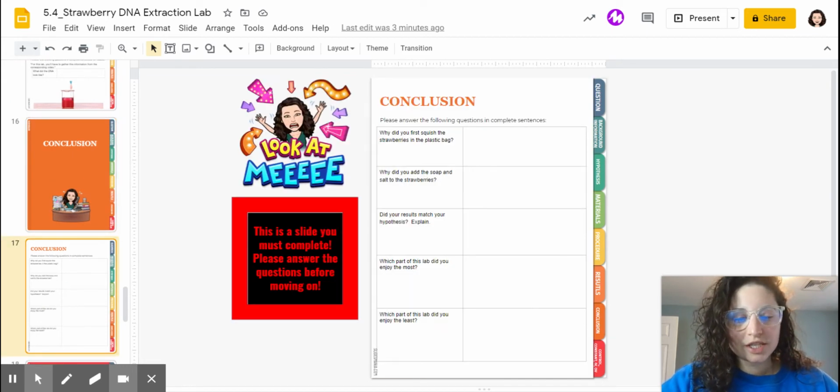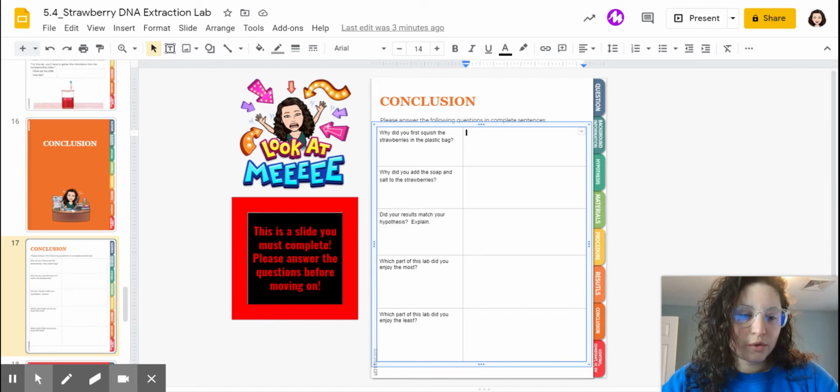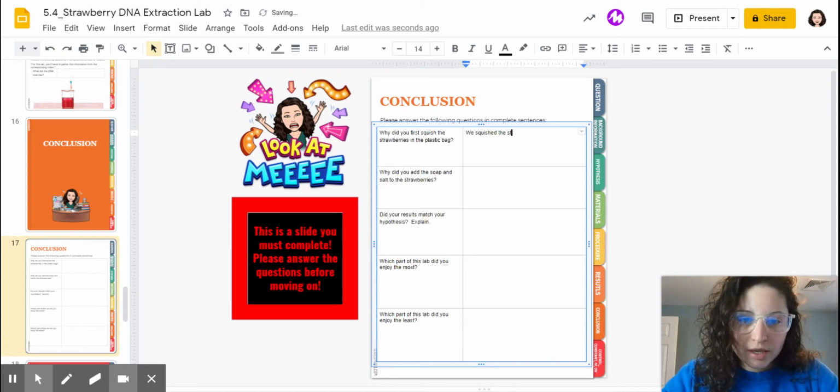And there are some questions to answer over here. So let's answer them together. So the first question is, why did you first squish the strawberries in the plastic bag? And the answer to that, if you don't remember, it was said in the procedure video, but we squished the strawberries in the plastic bag in order to start to break up the strawberry cells.